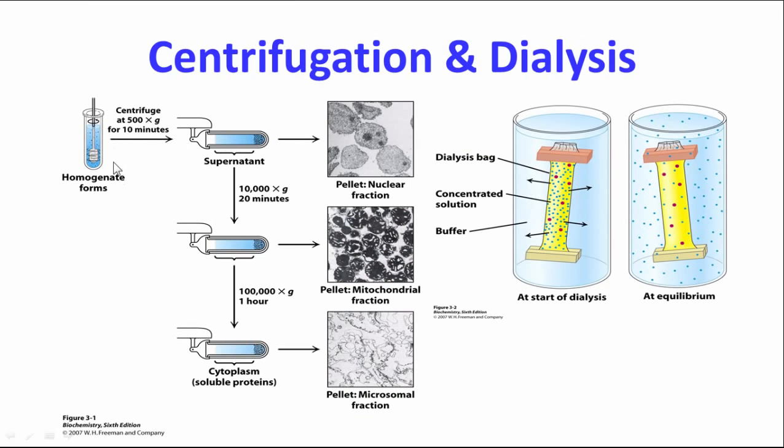Centrifugation, you can do differential centrifugation. In various ways, you can isolate nuclear fractions, mitochondrial fractions, or microsomal fractions. You can isolate Golgi and various other things, and that could enrich your sample for the enzyme you wish to purify, and I'll show you an example of that later.